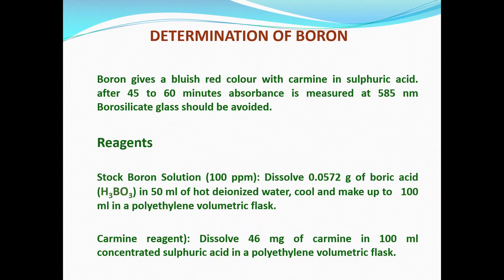Therefore, it is important for us to determine several metal ions, especially non-metals also, including surfactants, anions and cations. Sometimes we are expected to do the analysis of alkalinity and then hardness, all these things, including the phenolics, oils, etc. But we have spent a lot of time and effort to make complete water analysis using spectrophotometry. That is the beauty of this course.